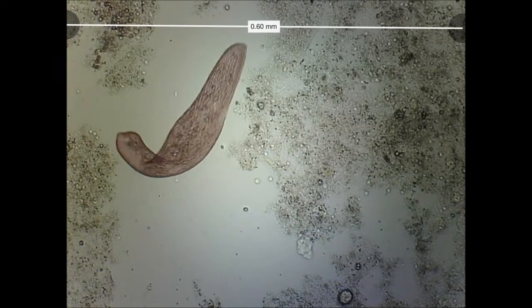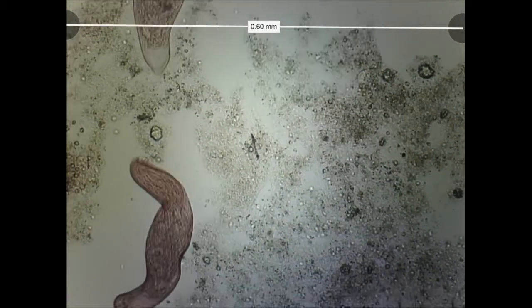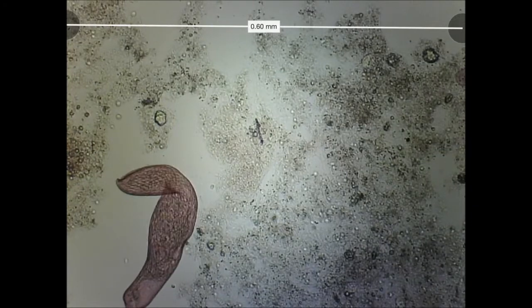Blepharisma is a really cool protist people know very little about. It's a close cousin of paramecium, and you can see therefore it is a ciliate.